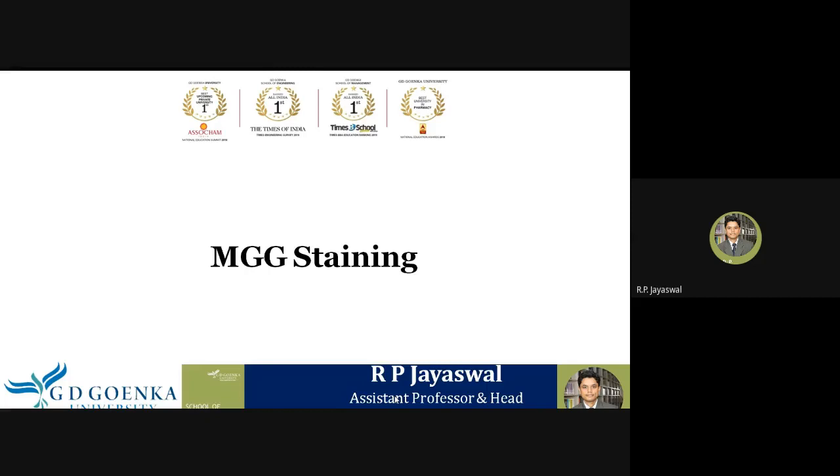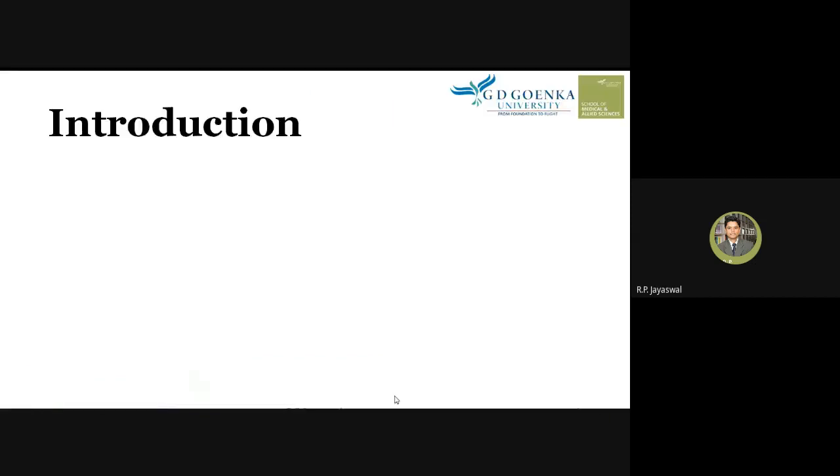Okay, students, we are going to study MGG staining. Let's know what is MGG stain, what are the principle, what are the procedure. Introduction to MGG staining.